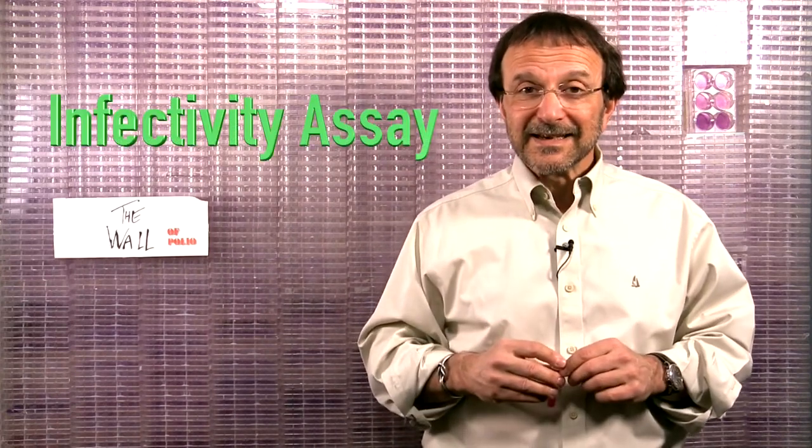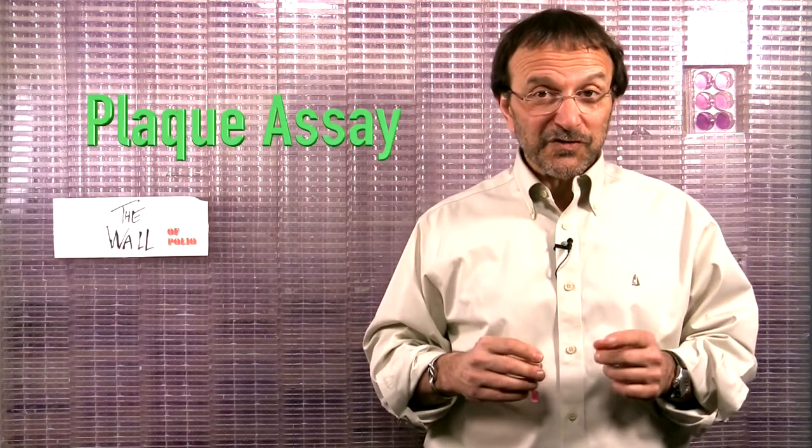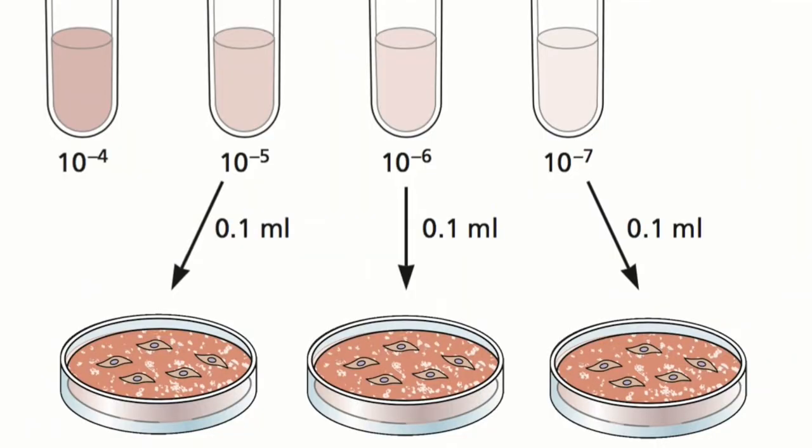Measuring the number of infectious virus particles requires an infectivity assay, and my favorite is the plaque assay. Here is an overview of how it works. First, we infect cultured cells with a range of dilutions of our virus, and then we cover the infected cells with medium containing agar, which is a jelly-like substance produced from algae. The presence of agar makes the medium semi-solid.